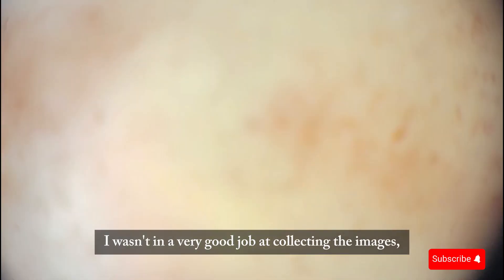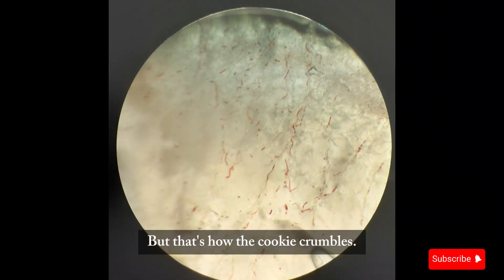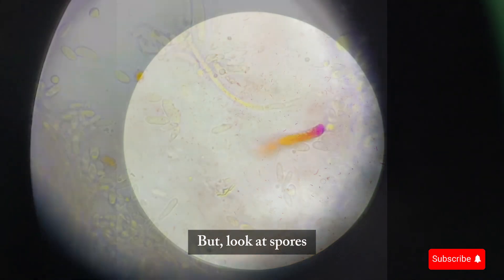I wasn't doing a great job collecting the images because they're pretty blurry and shaky. I don't have a camera mount, so I have to hold the camera while adjusting the microscope. But look — spores!